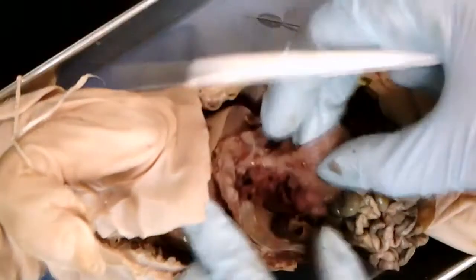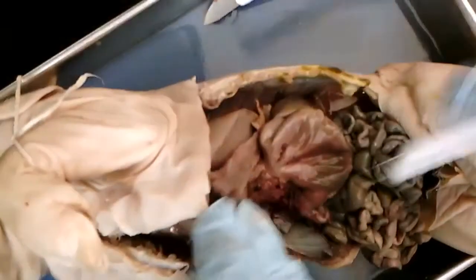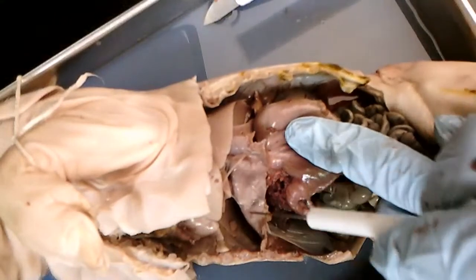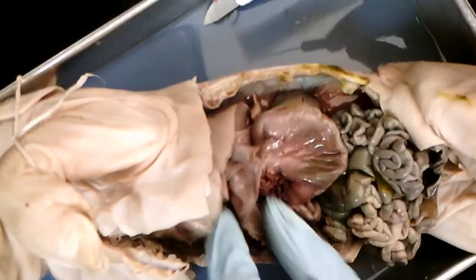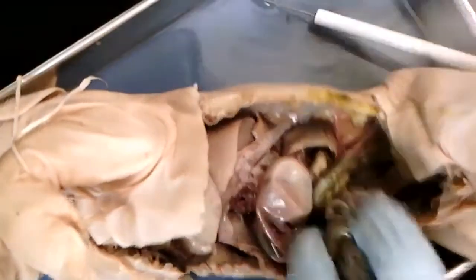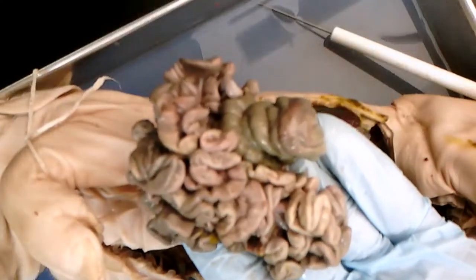Now, can you point out the diaphragm, Dr. Connor? Yeah, right here. Another good conversation point when teaching is the diaphragm, which separates the chest cavity from the abdomen. It also regulates and assists with breathing too. So it's a good conversation point that the lungs will only fill up with oxygen if the diaphragm's intact.